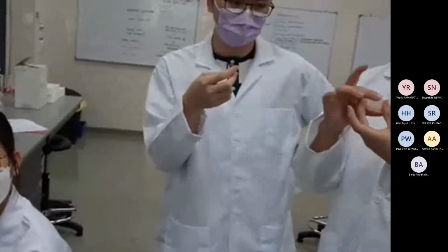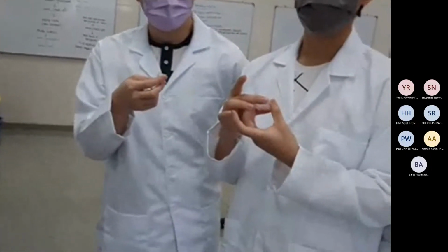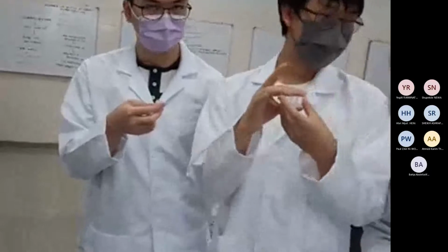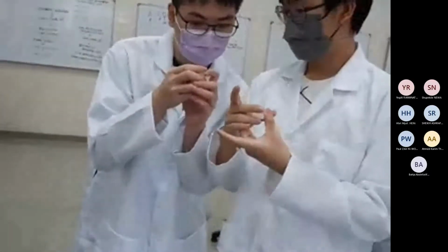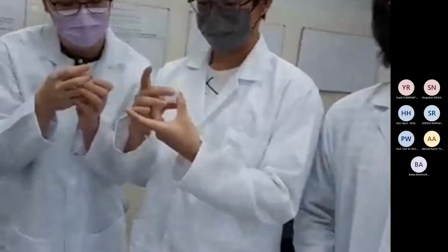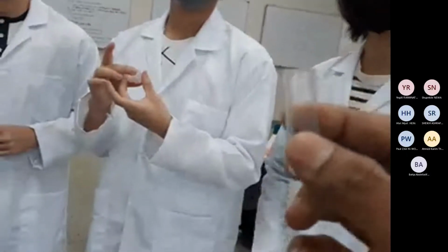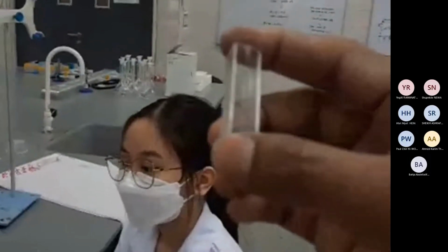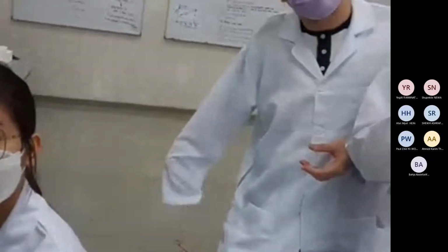Another thing is, before you put it here, take a tissue and wipe these two sides. Make sure it is dry and there is no mark on it. If there is any bubble trapped inside, it will give you a wrong result. So there shouldn't be any bubble as well.